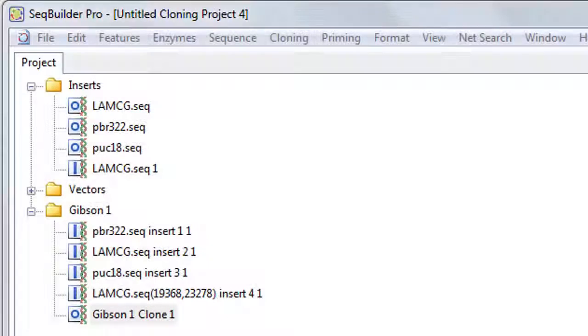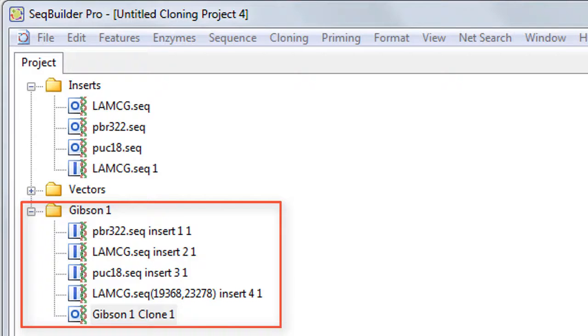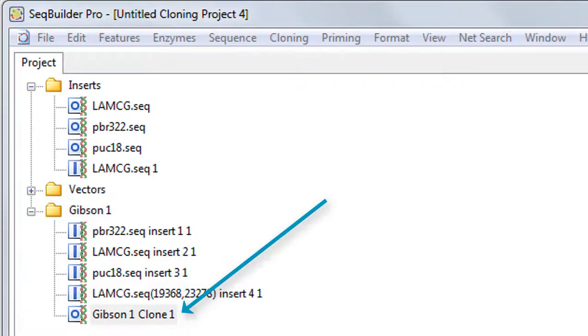Once your virtual clones have been created, a new folder is added to the cloning project window. Depending on the method used, this folder may contain a copy of each insert and entry clone, as well as the finished expression clone that will be used after recombination occurs.